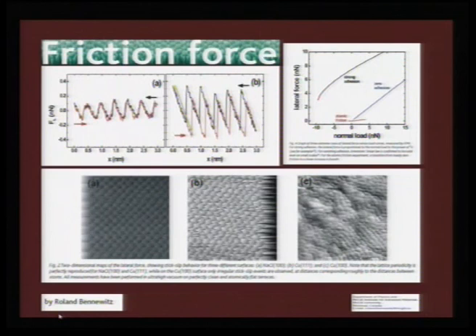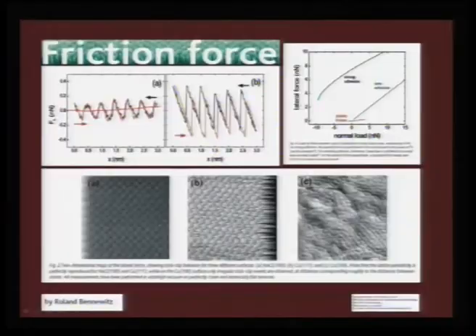We can also extend the same AFM principle to understand how the lattice arrangements are placed, and this is an improvised technique of your atomic force microscope, which is called friction microscopy. If you scan through a sodium chloride lattice, you can see the kinetic friction is averaged out, therefore it is zero. But once you place a load on your cantilever, then when it is placed on the top of an atom, it will take a frictional force until it is moved to the other atom, which will come out as a jump.